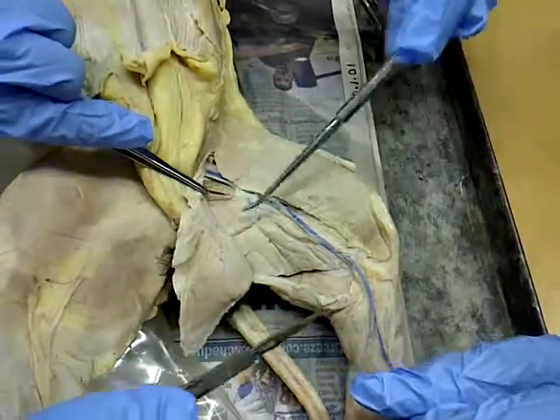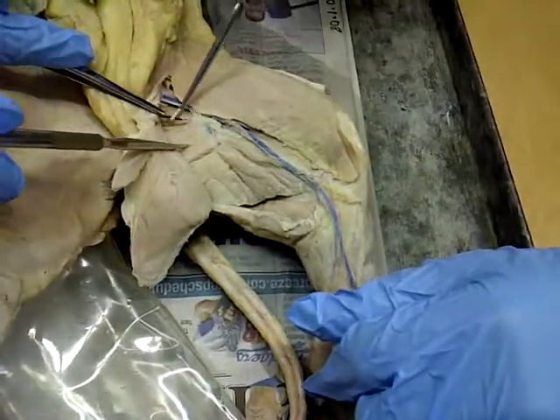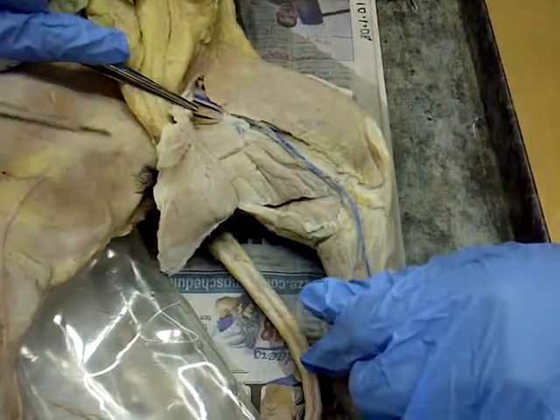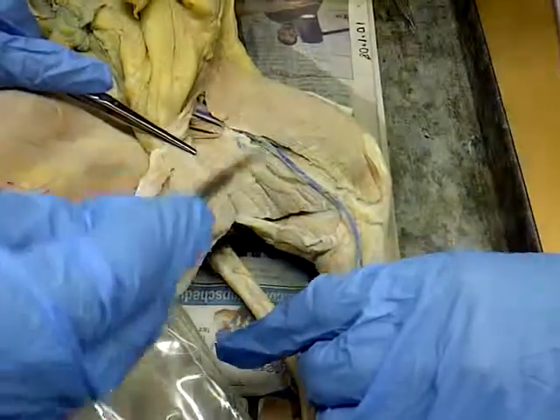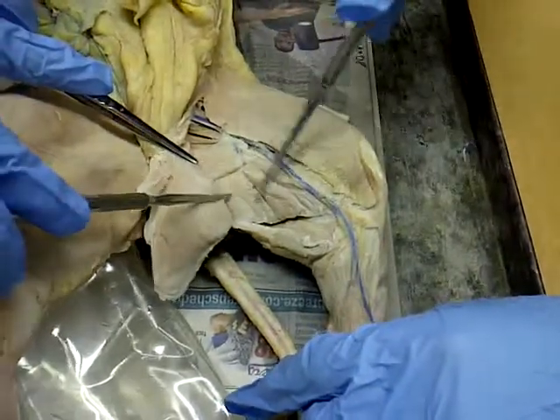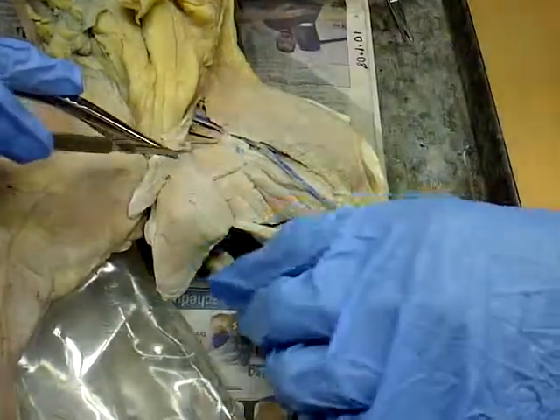You can always number them: 1 as the semitendinosus, 2 as the semimembranosus, 3 as the adductor femoris, and 4 as the adductor longus, so that you can remember those. So number those 1, 2, 3, 4. All right, back to the top on the legs. Do we want to go over that one more time? Okay. Semitendinosus, semimembranosus, adductor femoris, and then adductor longus.